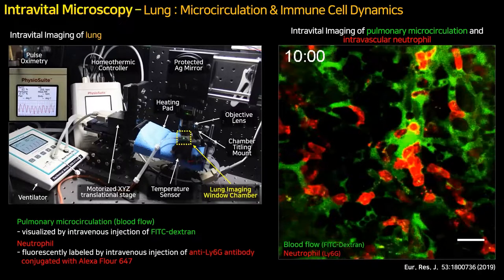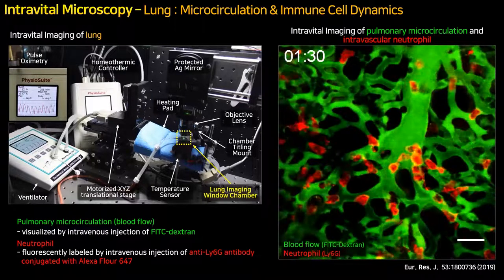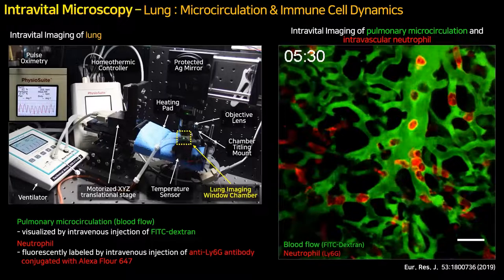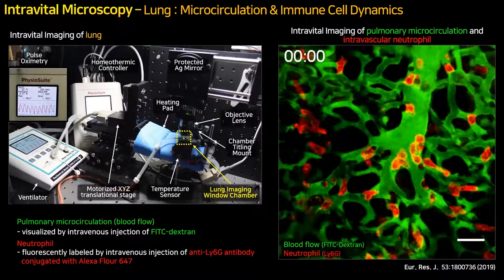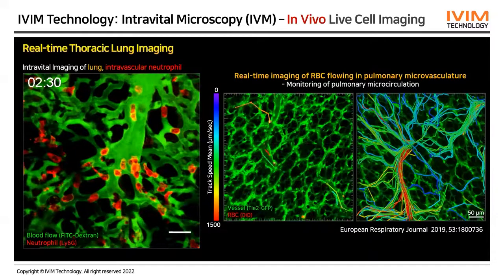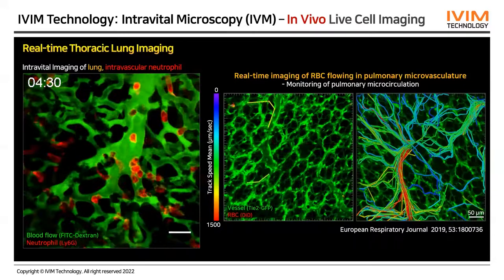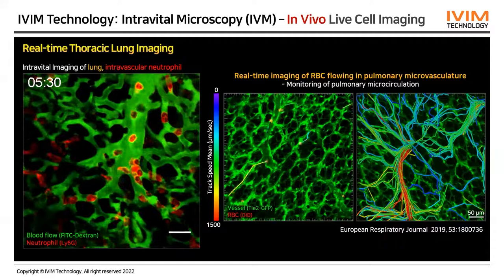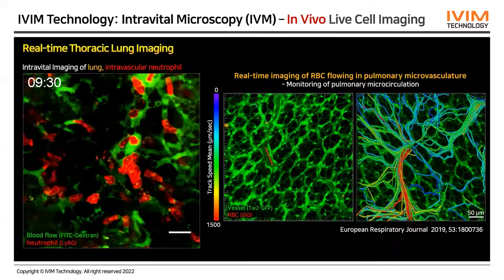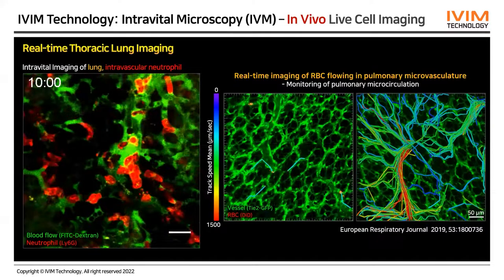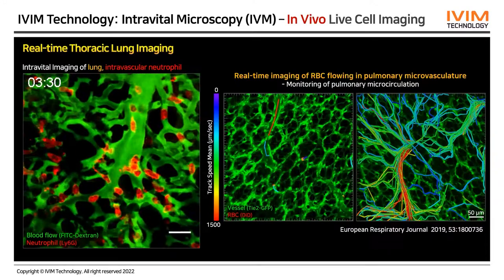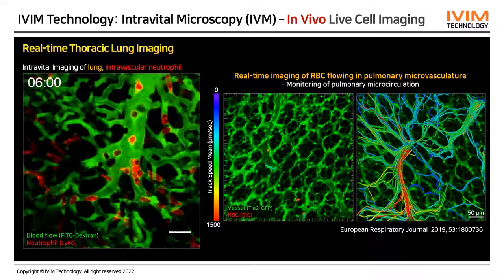Pulmonary neutrophils migrated to specific sites and blocked the micirculation of the lung blood vessels. This is an in vivo time-lapse movie of neutrophil infiltration in pulmonary microcirculation. We can also measure blood flow in a real-time movie of RBC flow, and analyze differences in vascular area-specific velocity in pulmonary microcirculation of the LPS-treated mouse model.